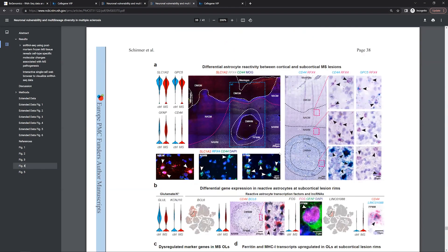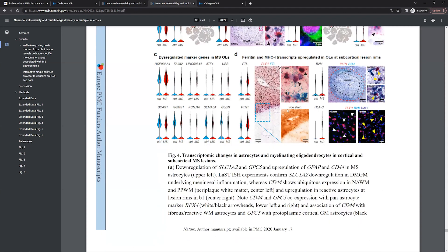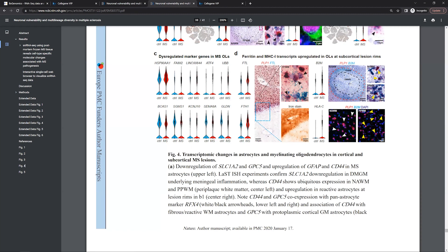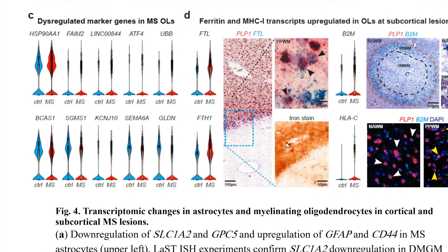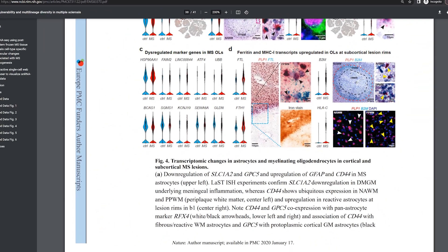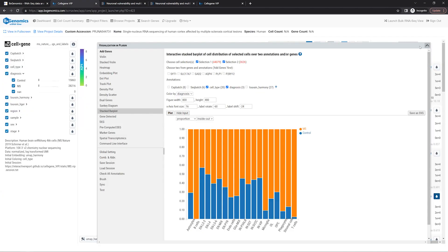Next, let's look at Figure 4D from the paper. The authors noted elevated ferritin levels in oligodendrocytes from MS patients, and these stress cells mapped strongly to iron-rich MS lesion rims. Both ferritin genes — light-chain FTL and heavy-chain FTH1 — were found to be highly expressed in MS oligodendrocytes. Now let's try to reproduce this observation using Cell-by-Gene VIP.